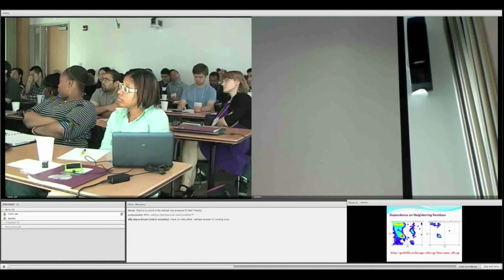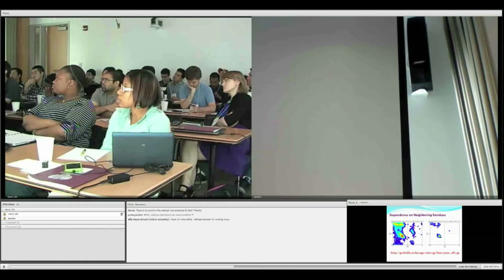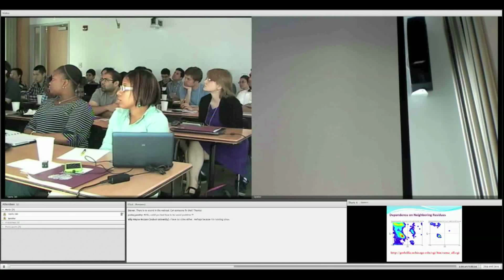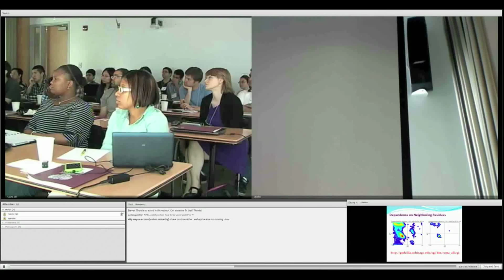If I put the neighbors as everything, I will get this whole Rama map for the alanine. However, if I specify the neighbors, if I restrict the neighbors to valine and E, then you can see that the Rama map shrinks by a lot. So these are cataloged from the PDB.